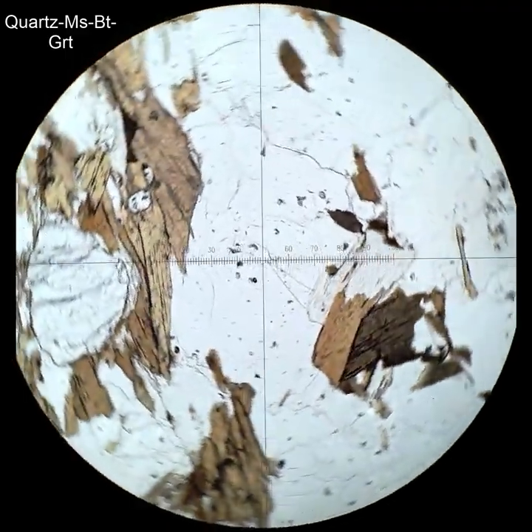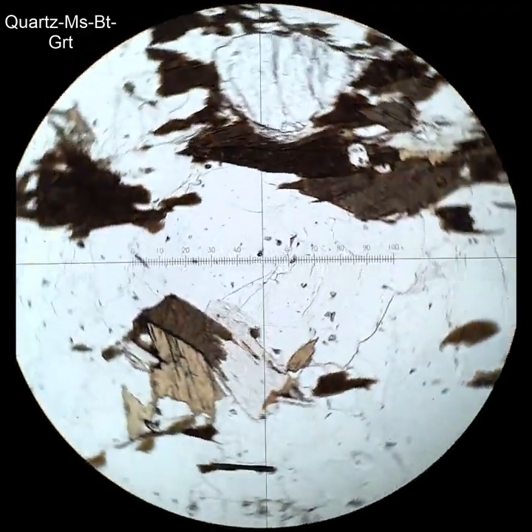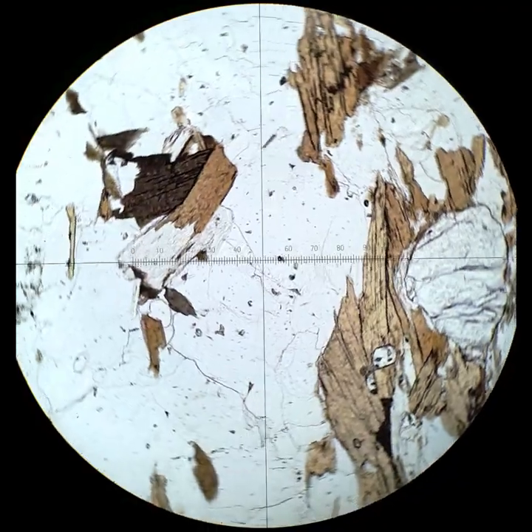Now, with this one, as soon as I cross the polars, you're going to say, Matt, that can't be quartz because it's yellow. And yes, that's absolutely right. When you cross the polars, this quartz grain is yellow because the thin section is a little bit too thick. And I would guess maybe 5% of my thin sections are a little too thick and the quartz is kind of yellowy. But you can still see that domainal extinction characteristic.